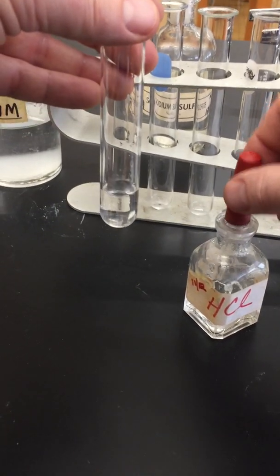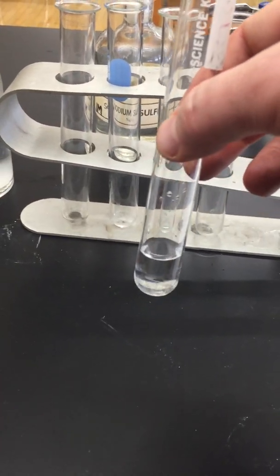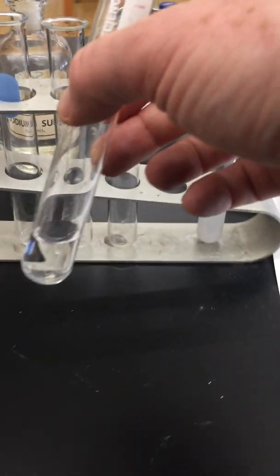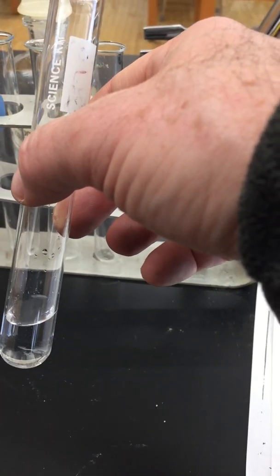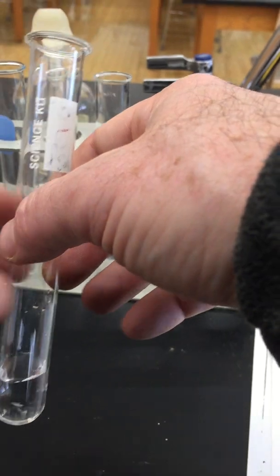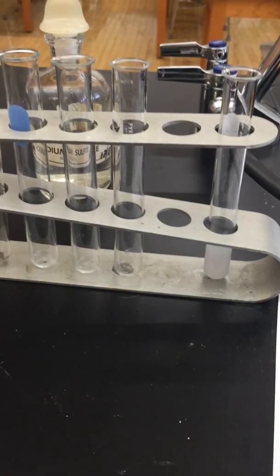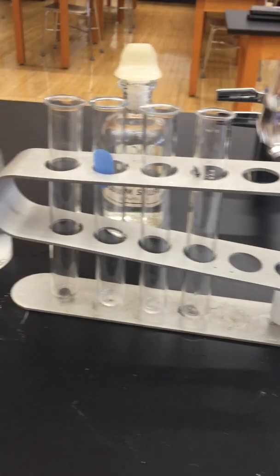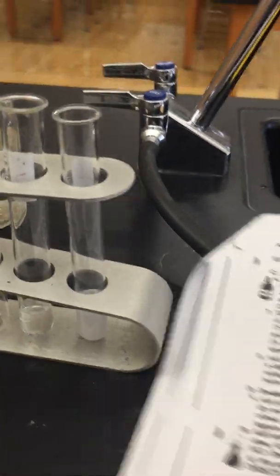Now there's nothing visual here, but the directions tell me to observe the odor given off by the mixture by wafting some of the gas toward your nose. You know that wafting means this, and I will give it a waft. And it does smell like rotten eggs. It smells like sulfur. Okay, so that does it for the lab.